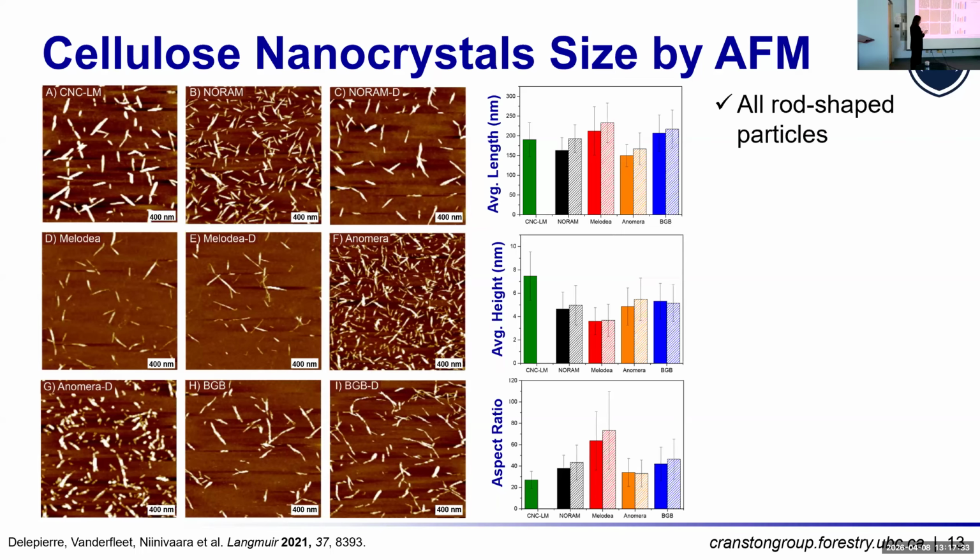So I'll just highlight here for a second that we normally measure the height. So that would mean we draw a line profile across and then we look at the height of the particles, but we don't normally measure the width. Does anyone have an idea why I have a height measurement but not a width measurement here? If you've done AFM, you might know.